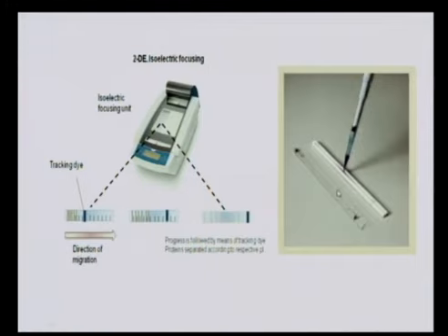So here there is no need to prepare the isoelectric strips manually. Commercially they are available in the market. One can buy and load the sample as per the instructions. And here on the bottom side you can see the direction of migration.